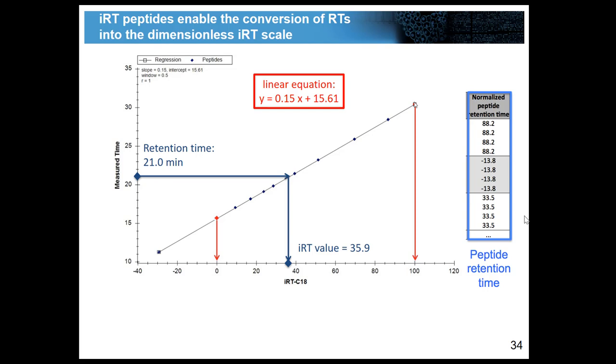The reason why they didn't go for the first one, the second one, was, as far as I know, because this was less stable. And that's also what I see very often. The peptides at the very extremes tend to have bigger variance than the ones in the middle. Another reason was the first peptide, a lot of the time it doesn't bind to the column at all, so it basically shoots out. So maybe they should have just removed the peptide. It would make it much easier for these didactic lectures.